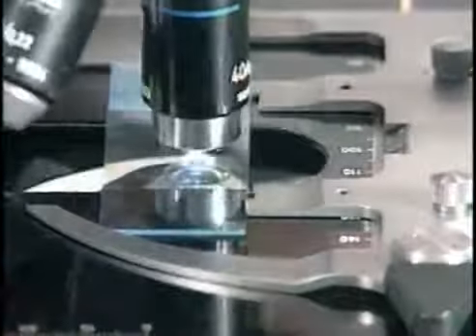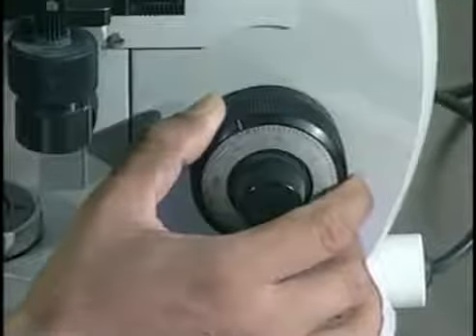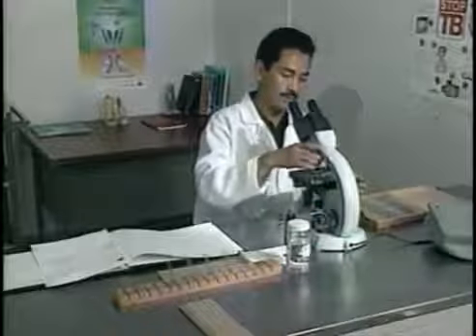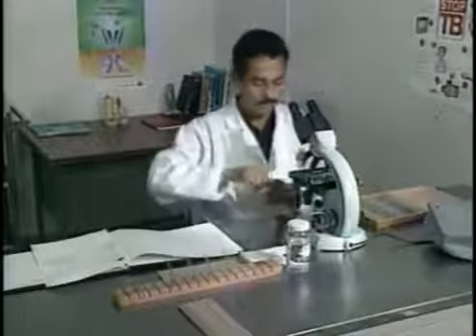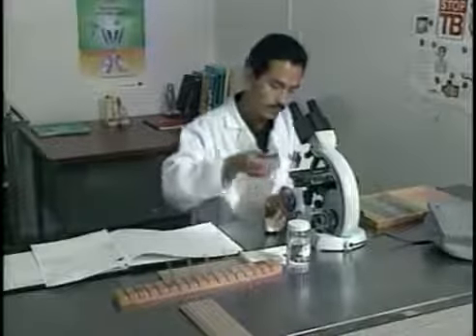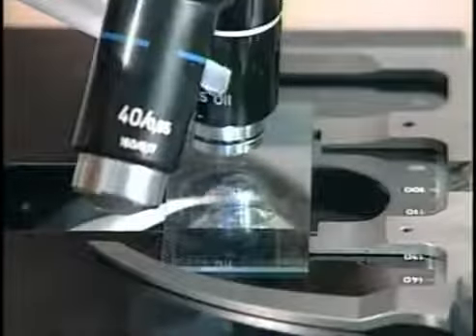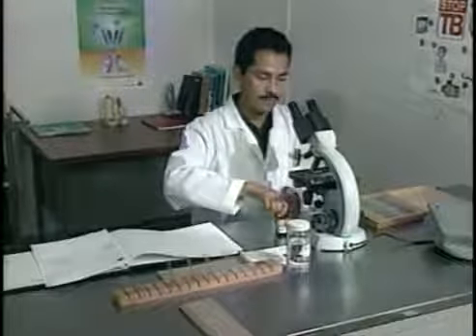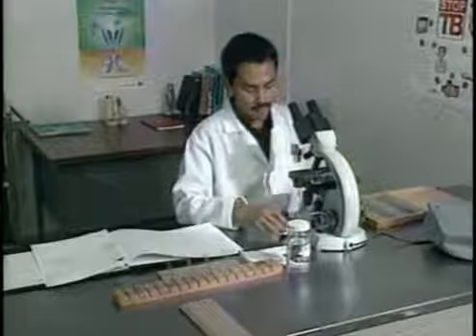Use the 40x objective to focus and determine a suitable reading area of the slide. Place a drop of immersion oil on the stained smear. Let the drop fall freely onto the slide. Never touch the slide with the oil applicator. This could lead to carryover of AFB in the immersion oil to the next slide.